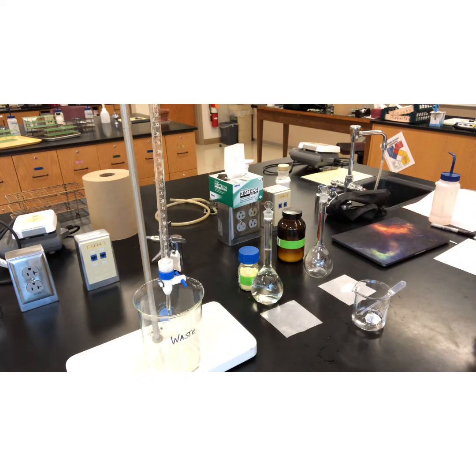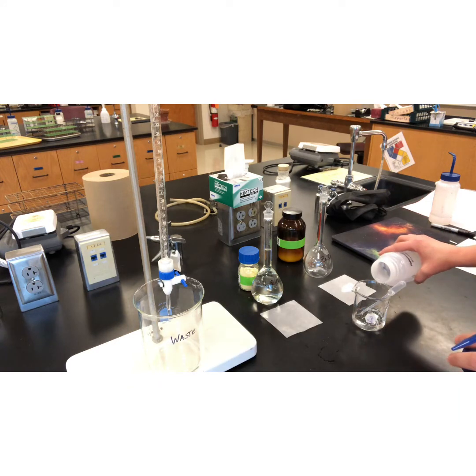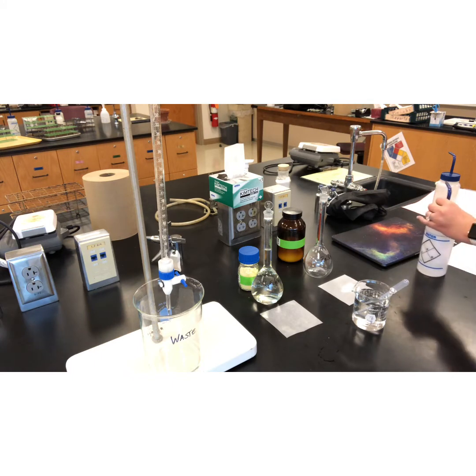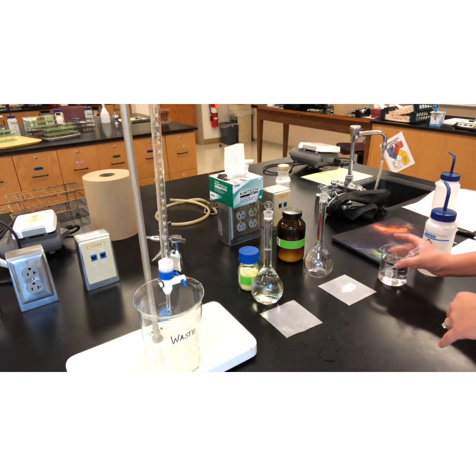All right, so next up, I'm going to make my approximately 0.50 molar zinc sulfate solution. Again, we calculated approximately how much mass we would need to make that solution, so I've weighed out exactly 3.6529 grams using the analytical balance, giving us lots of significant figures.